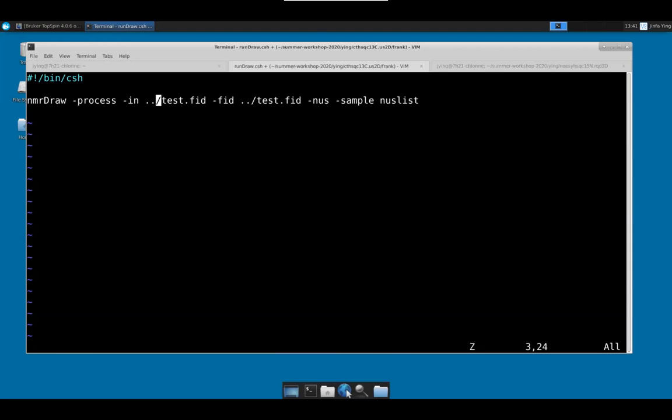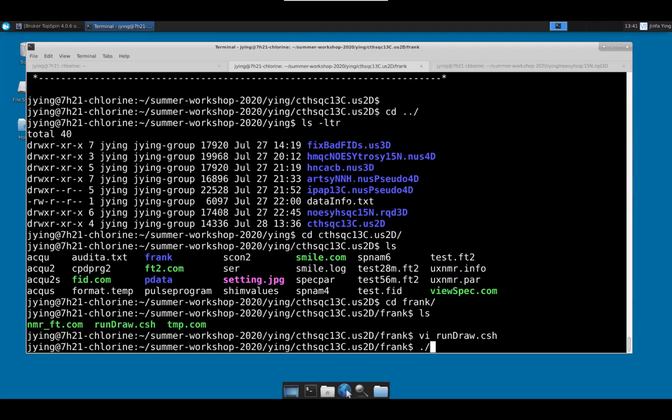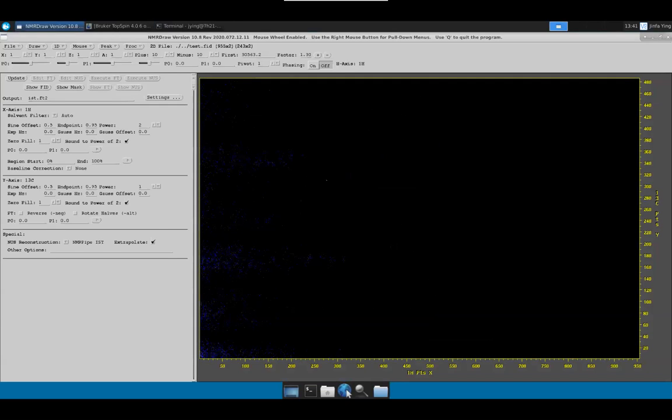Okay, and then if you run that, actually this is the Frank stuff that allows you to graphically set up the processing script. And as I said, it's existing. You have to look at what Frank does, his seminar, his workshop, his YouTube video to learn this. I'm sorry. I did this at some point, but since I don't use it every day, I forgot how to use this. But it's existing.